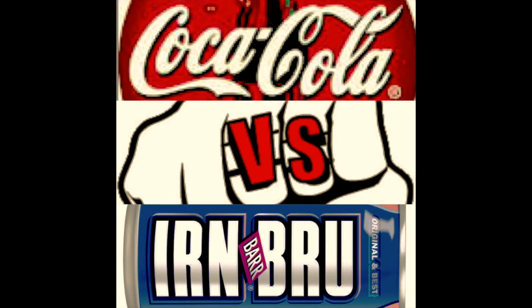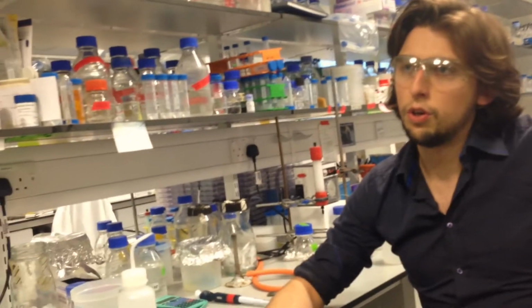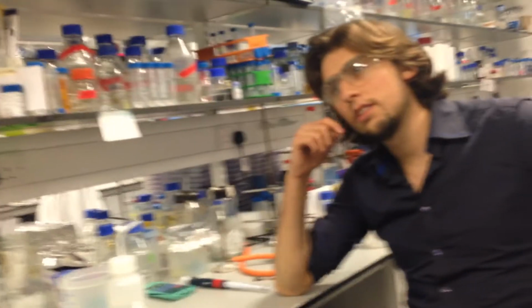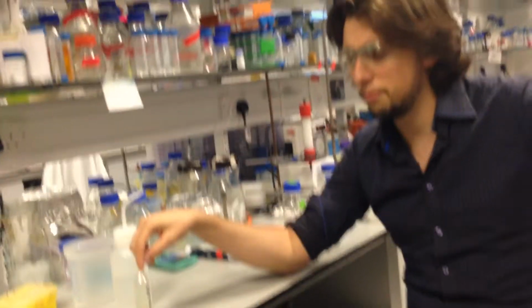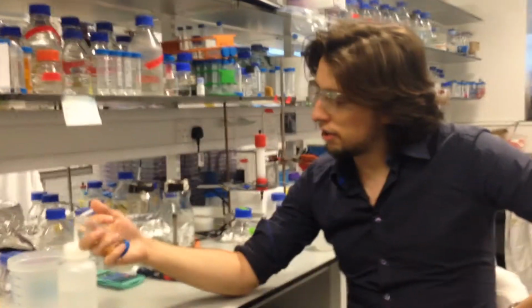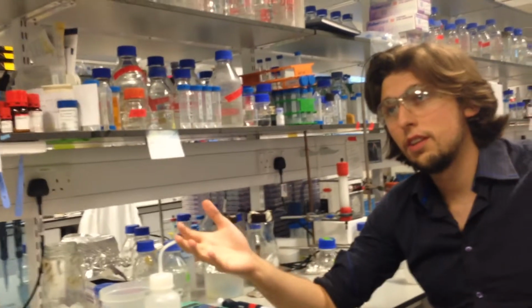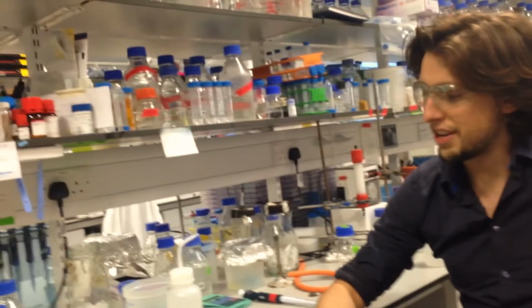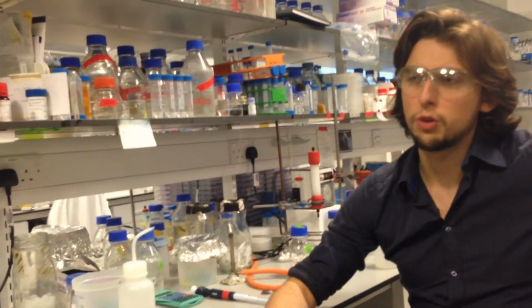So, would other fizzy soft drinks like Coke have the same or similar effect? I imagine Coke would probably not work, because I think it uses phosphoric acid to control the pH in Coke, whereas I think Irn-Bru is ferrous citrate, ferrous being where your girders come from. But having phosphate, you'll get crystals of salt in your drop, and that of course is not protein, which is not what I want. But I'm sure any other number of fizzy drinks that did not contain phosphate would probably be okay.